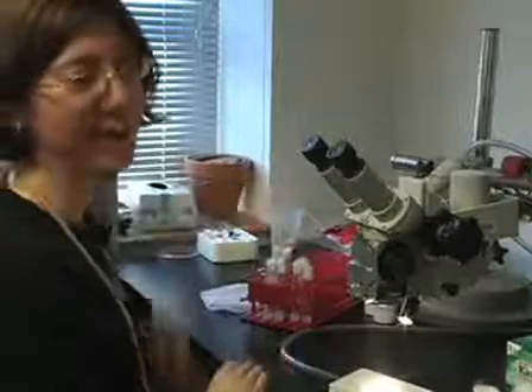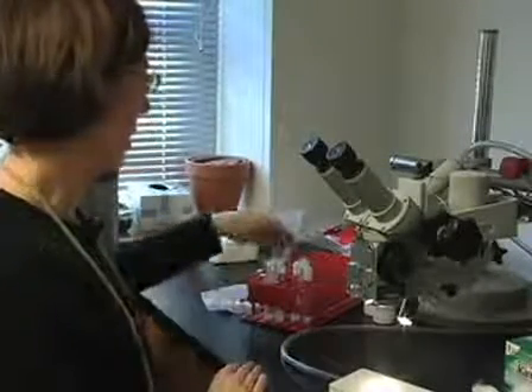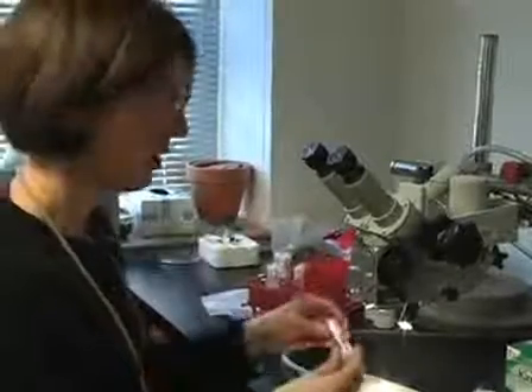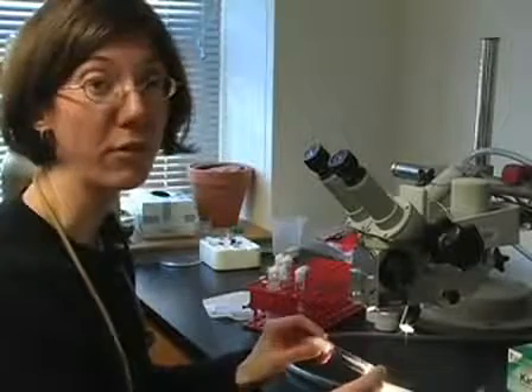These pupae are placed back into the day-night cycle climate-controlled incubator. The next day we check if they've eclosed, and we write the date on which the flies have eclosed. Then we age them for three to five days.